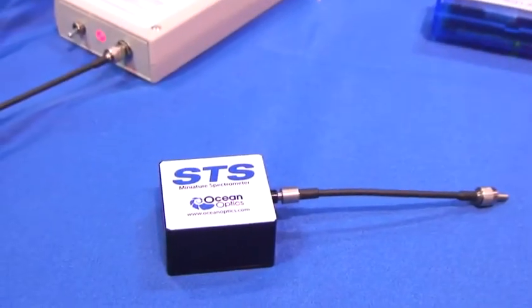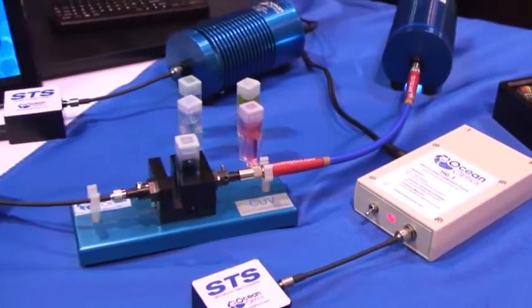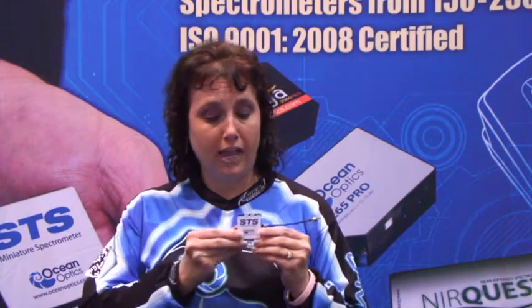Hi, I'm Yvette Matley, Senior Application Scientist at Ocean Optics, and I'm here with the newest version of our STS Microspectrometer. We have added to this product line over the last year, and we now have versions available to give you UV sensitivity starting at about 200 nanometers. We've also improved the etalon in the VIS and VIS NIR versions that we currently sell.